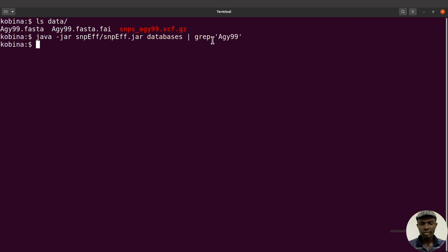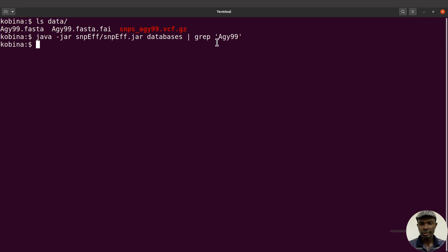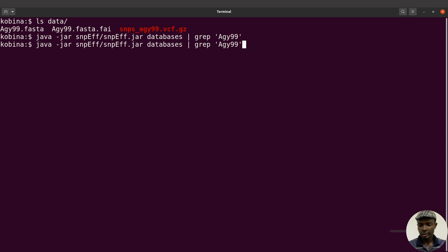We can modify this because sometimes with grep, the pattern we give may not match if the name is in a different format. So we are going to reissue this command — this time we are going to ignore case, so anything AGY99 will display regardless of whether it starts with a lowercase or uppercase letter. I'll recall the command and this time add the -i flag, then execute again.